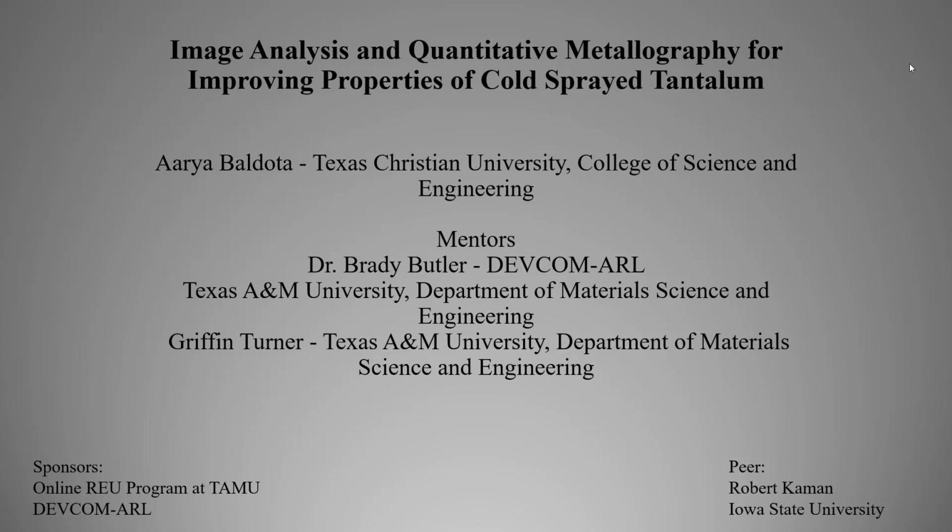For this summer's OREU program, I studied image analysis and quantitative metallography for improving properties of cold spray tantalum.